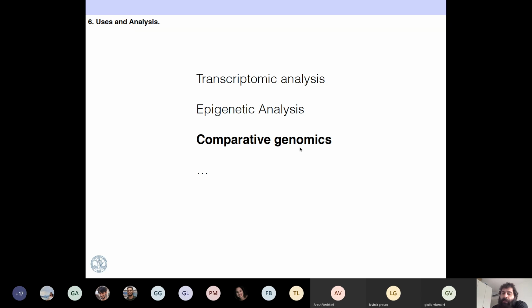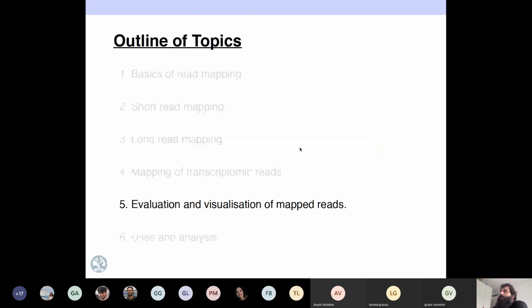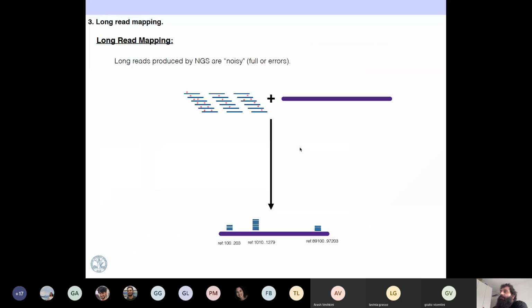Okay, so the purpose of sorting BAM files with some tools is to make the next tools more efficient. So when you are trying to identify genes, let me put this example here. Once you have the mapping, the problem is that you don't have them sorted.